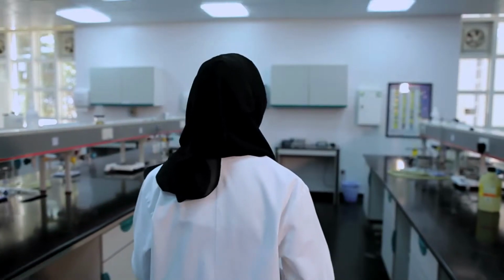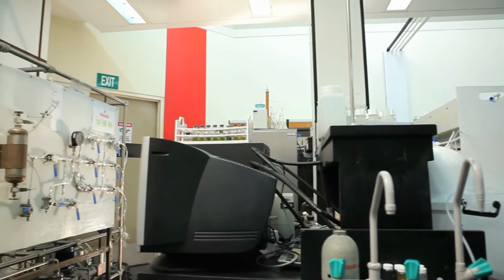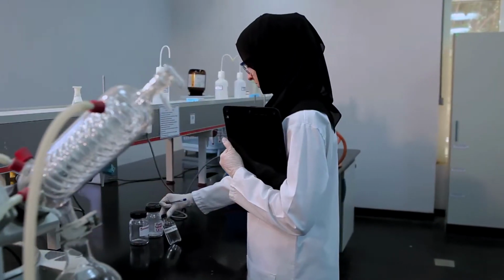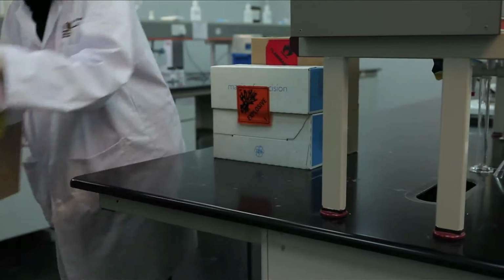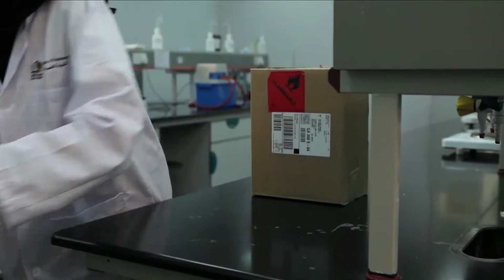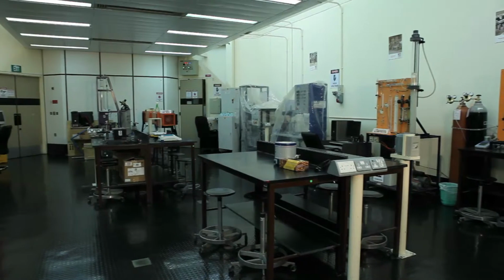Next, conduct a thorough evaluation of your entire lab, including your housekeeping and storage practices. Begin at the main entrance and take a careful look around. Good housekeeping helps eliminate fire hazards and maintains access to emergency equipment. Be sure all laboratory spaces are clear of all unused boxes, paper, and other combustible materials, as these items increase the potential for fire in the work area.